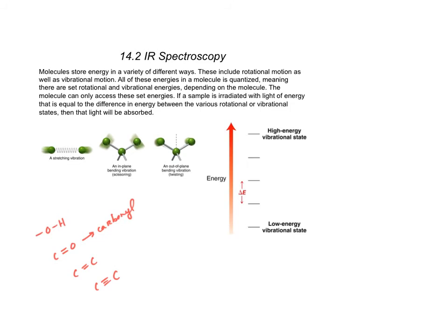So let's say that I made a compound, and I knew that it was made up of 2 carbons, 6 hydrogens, and an oxygen. The whole purpose of spectroscopy, and what we're going to be using it for, is determining what the structures of these compounds are. Because if I have this information, 2 carbons, 6 hydrogens, and an oxygen, are there a variety of different combinations? Oh my God, yes. So one thing this could be is an ether. This could be a dimethyl ether. What else could this be?